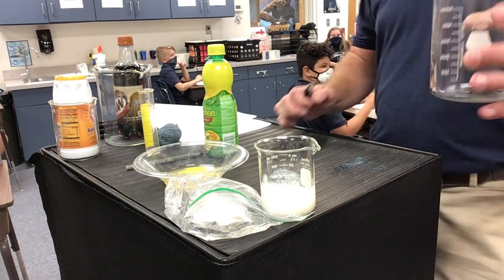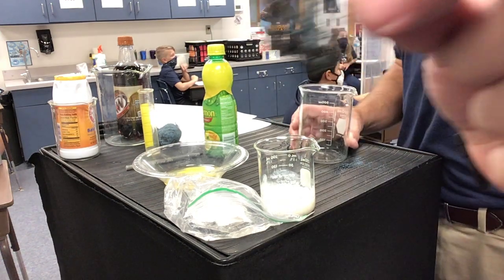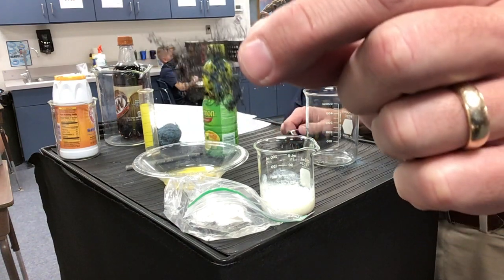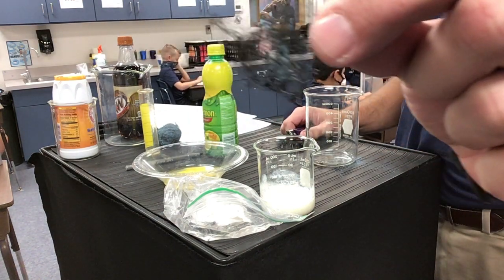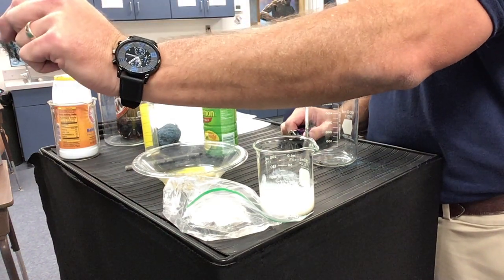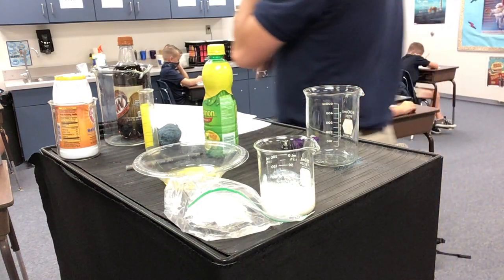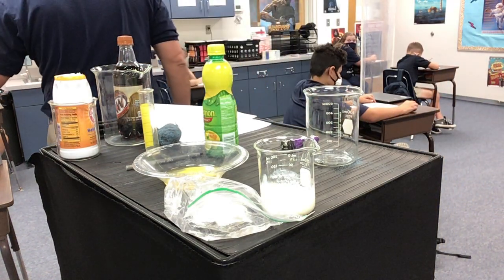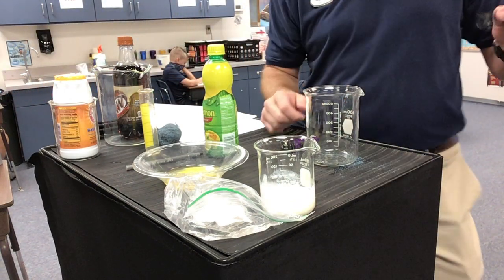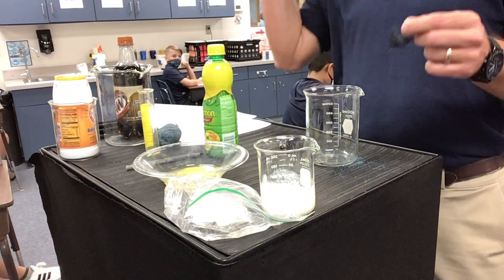Okay. Again. Did it change color? Did it make bubbles? Does it smell? Does that smell? She said, yep, smells different. Did it have a different temperature change?